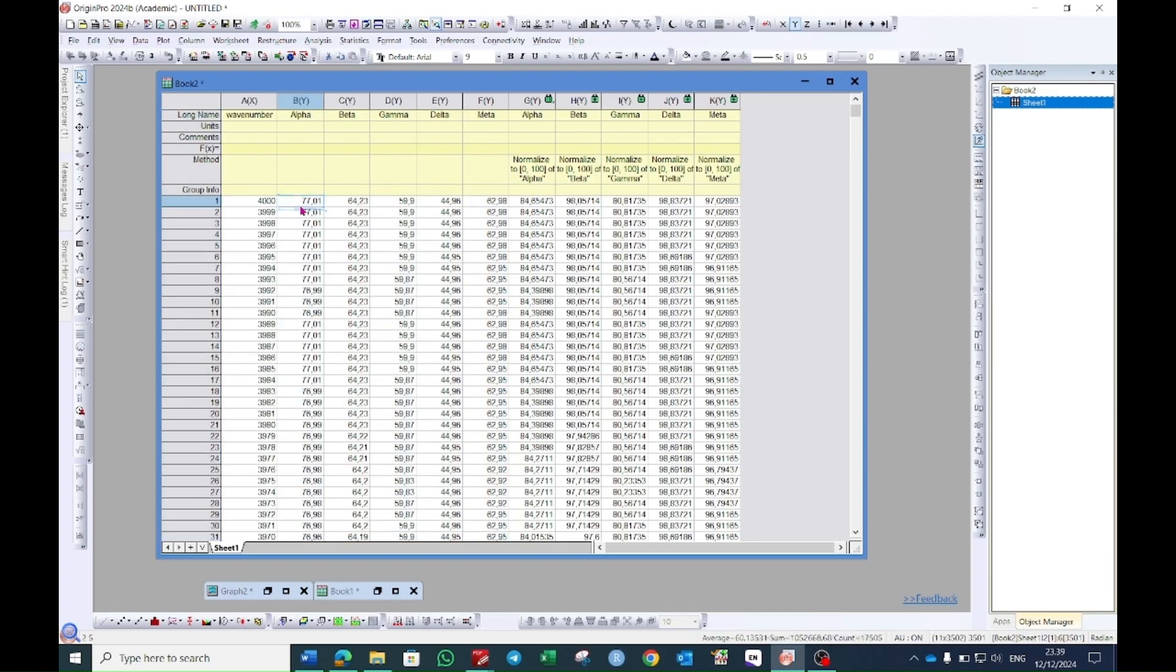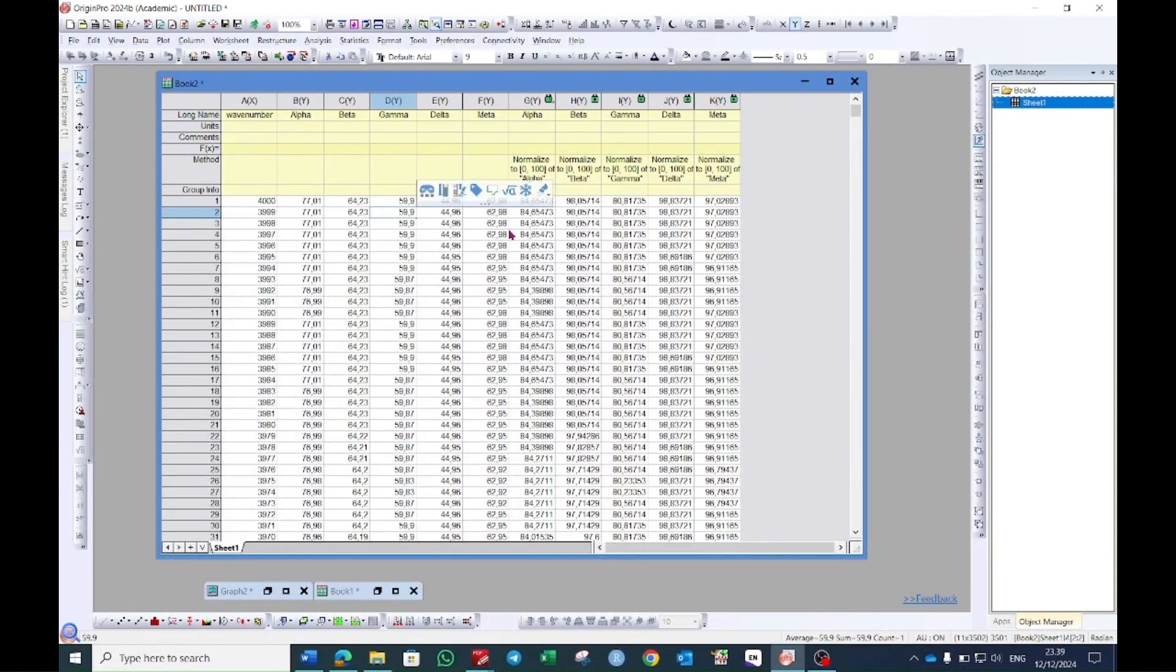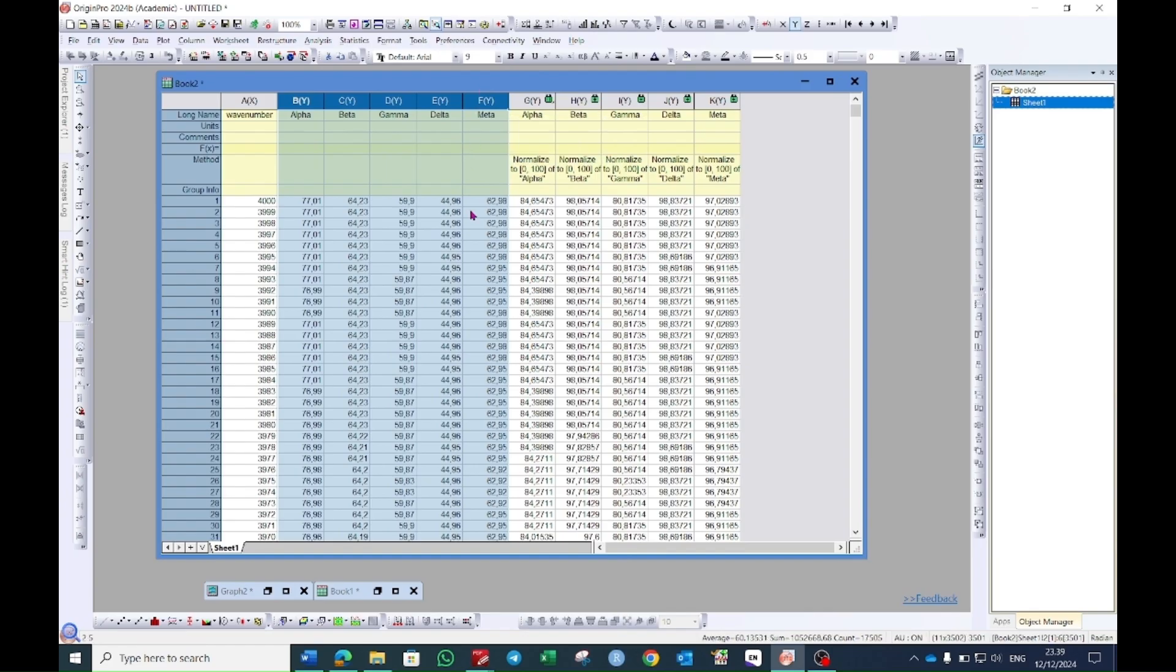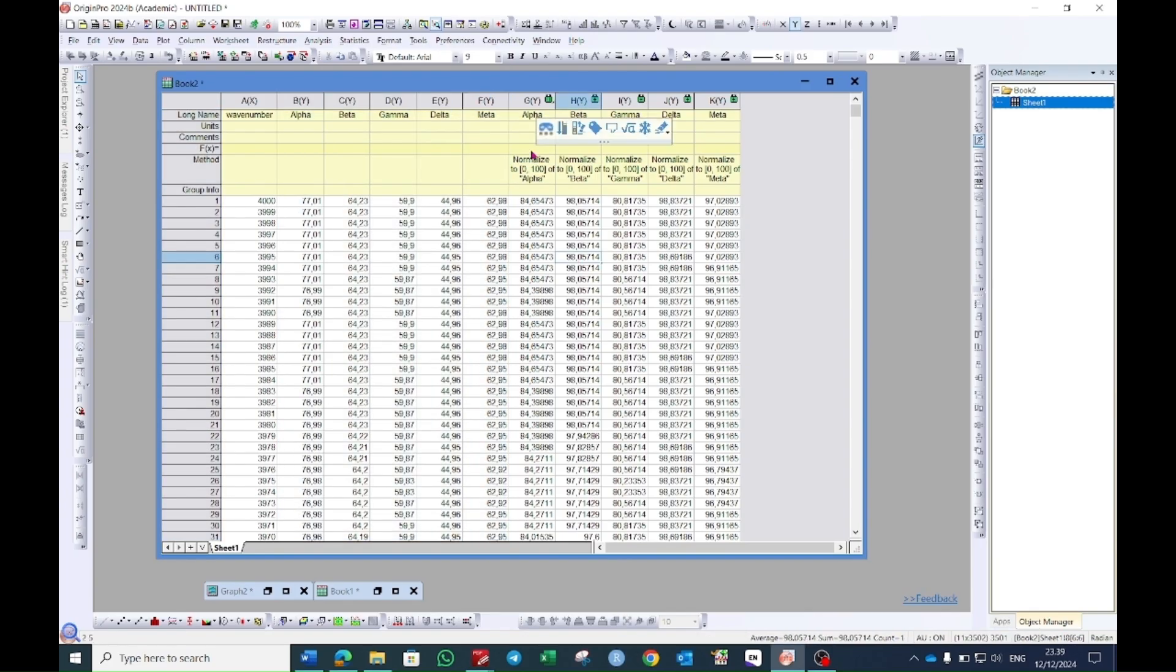In this way all of your FTIR transmittance values are converted into the normalized form. The minimum is given the value 0 and the maximum is given the value 100. You can still plot your values using these values but I will suggest you do this normalization to better visualize your data.